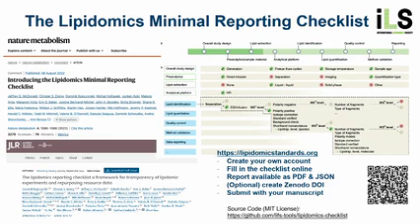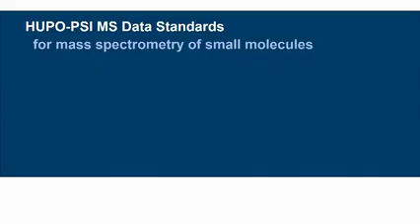And the basic data model also allows you to export the information in a JSON, a structured JavaScript Object Notation object. So those of you who program probably know more about that. Last but not least, you also get a citable DOI for your checklist report. So that's, I think, something that also goes back to crediting not only data sets, but also method descriptions. This is something that others can cite, and that also increases, of course, the impact of your own work.